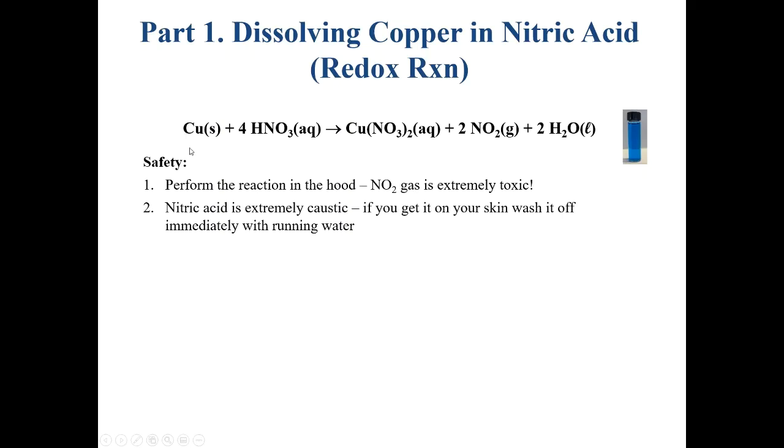Now, there will be a video that follows this lecture that shows this reaction. You'll notice that a very brown, noxious gas is formed. That brown gas is NO2, which is a product of this reaction. They run this reaction in the hood because that gas is toxic and it's not something you'd want to breathe in.